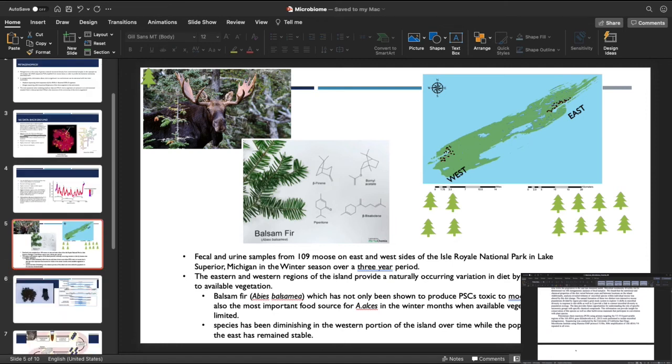So today the tutorial will go over, I'll explain in detail the different approaches we take for statistical analysis of microbiome. So overall, this is a nice flow sheet. In this situation, it's fecal samples. You send those off for sequencing, and then you get raw sequences back that are literally just like A, T, G, they're just in a row.